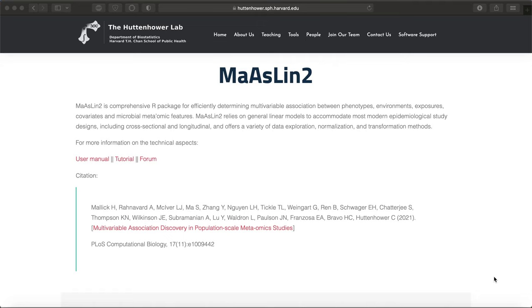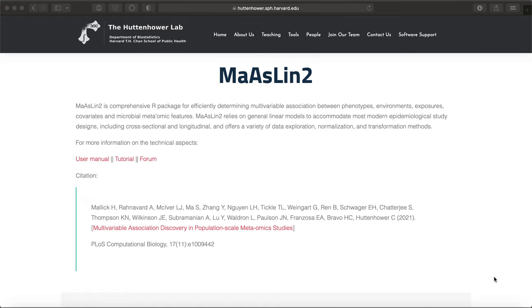So MaAsLin2 is an R and Bioconductor package for associating microbial data with complex clinical metadata. What this also is is a multivariable framework that models a univariate outcome or dependent variable, such as bacterial taxa, against multivariate metadata, so your predictors or independent variables. And within this framework you can also model hierarchical random effects in addition to fixed effects.